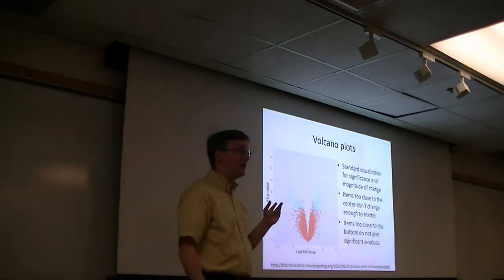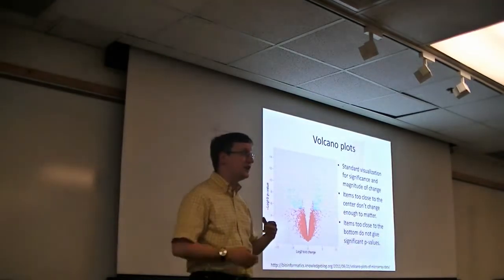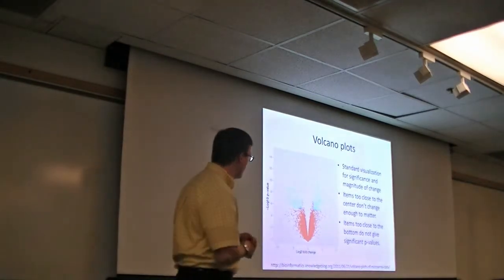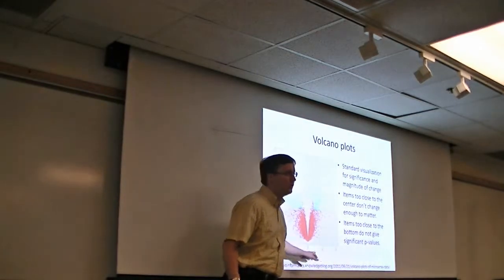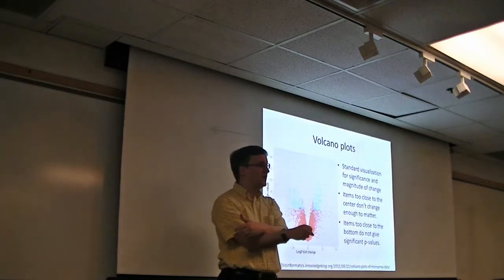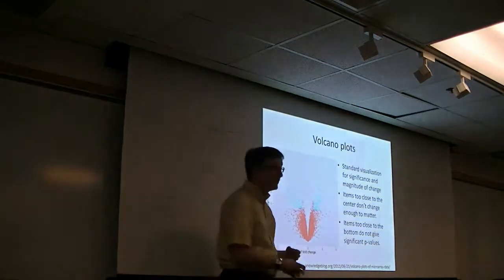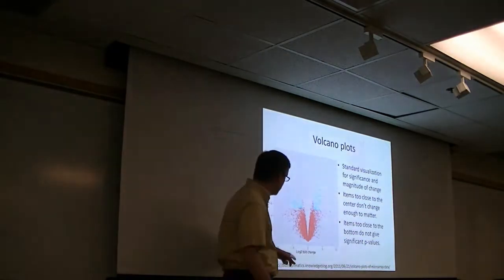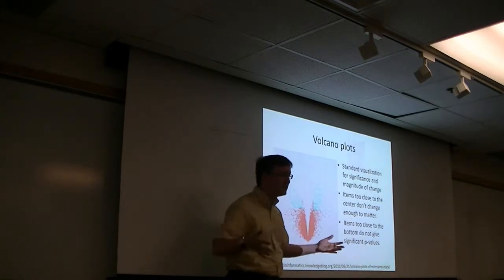Nothing else I really care to say there, so let's move on. Volcano plots are becoming very frequently seen across systems biology, and understanding them, I think, is very valuable as well. So in this case, we have a fold change. So some metabolite has maybe a low concentration in the A's and a high concentration in the B's. So that's going to lead to a big fold change. Typically, we show these on a log scale. The reason for this is to flatten out these differences.